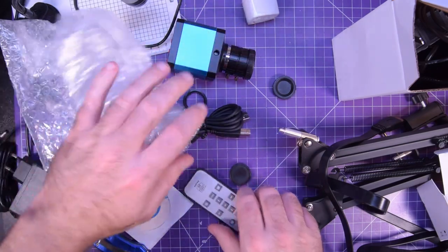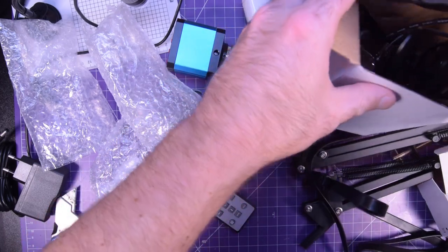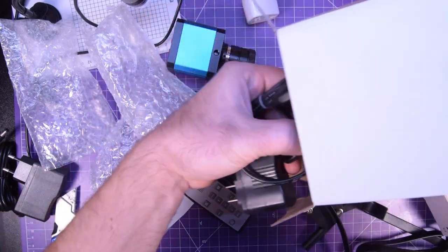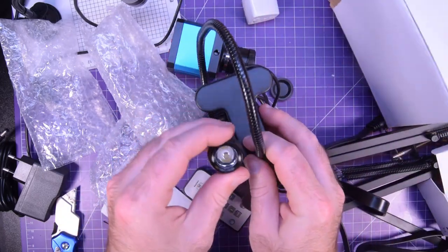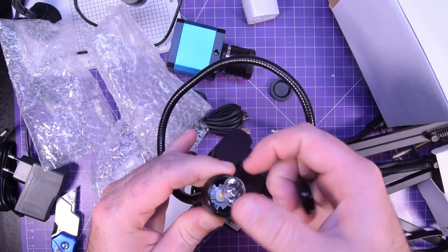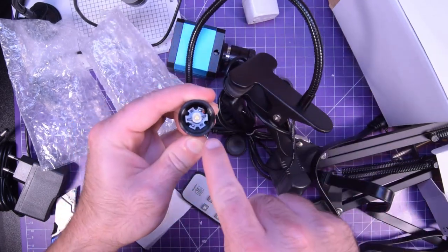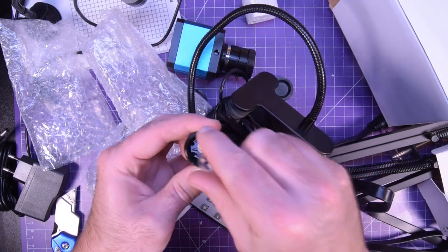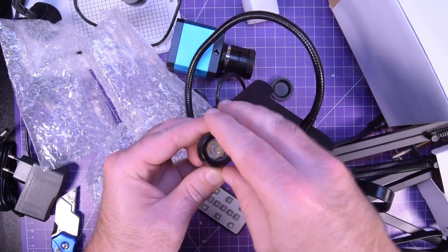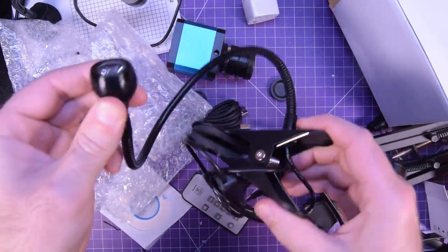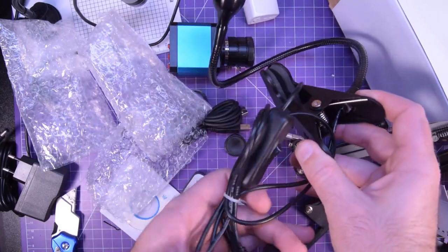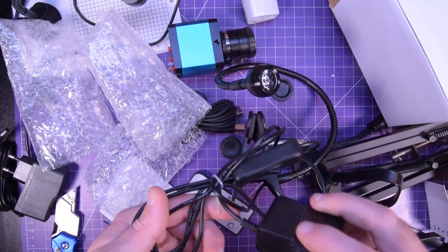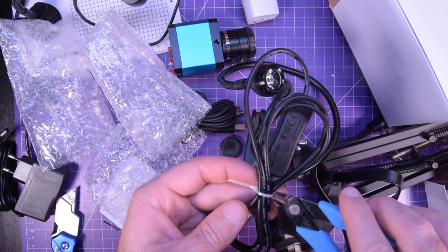And this kit also included one more thing. So this one has the proper adapter on it. There we go. Just a little light. It looks like this light uses a LED with the lens. Oh, yeah. It uses one of these sort of like Luxeon stars or whatever they're called. Looks like a two to three watt jobby with a dispersing lens. And this has a little on off switch.